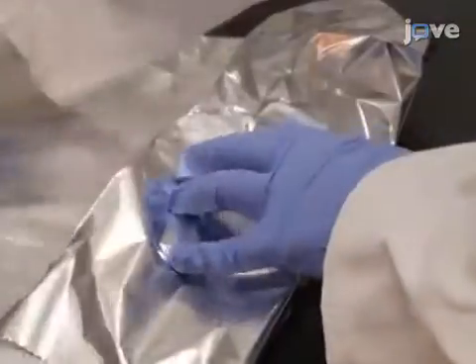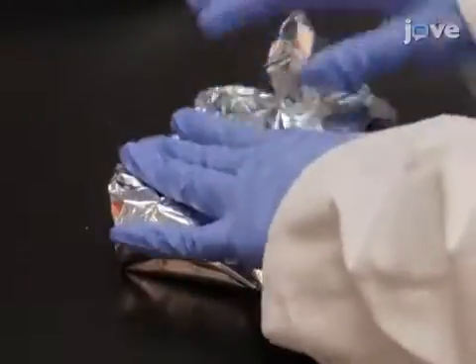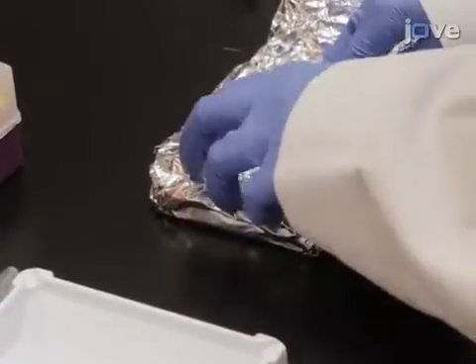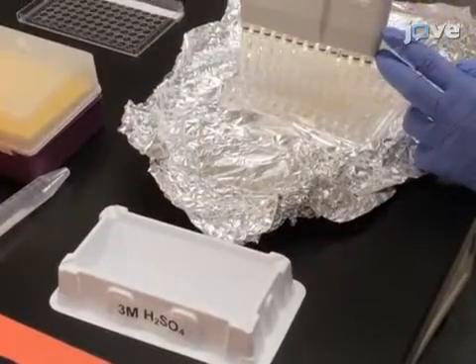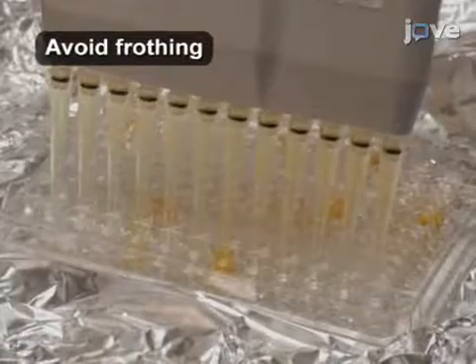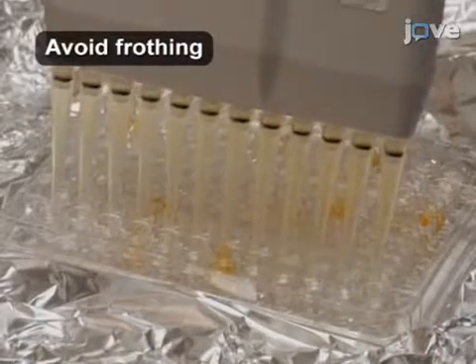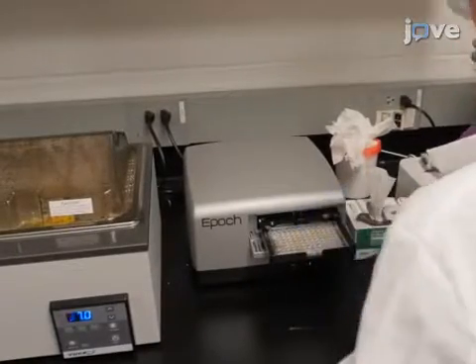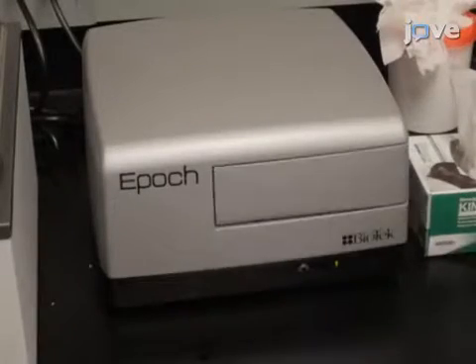Incubate the plates in the dark at room temperature for 30 to 60 minutes. To quench the reaction, add 50 microliters of 3 molar H2SO4 to each well and gently pipette to mix the solution. Finally, measure the absorbance using a plate reader at 492 nanometers.